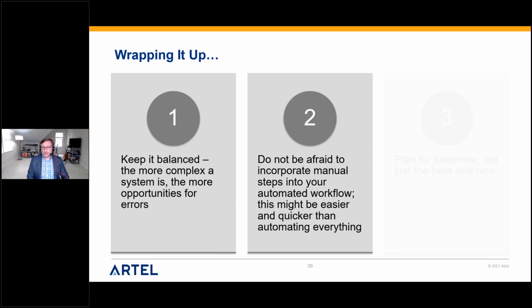And don't be afraid to incorporate manual steps into these automated workflows. It actually might be easier and quicker than automating everything, because anything can be automated, but that's where it becomes very challenging. So, understand what it is you need to do.